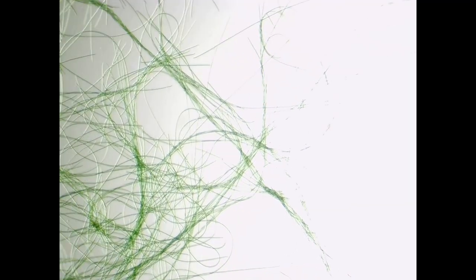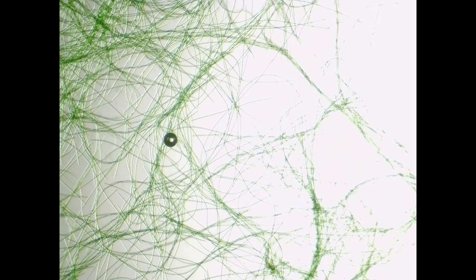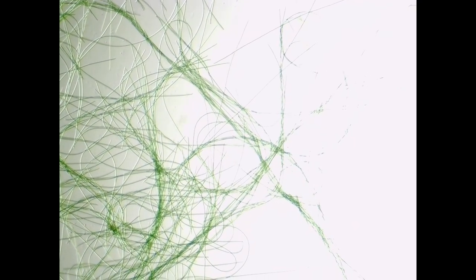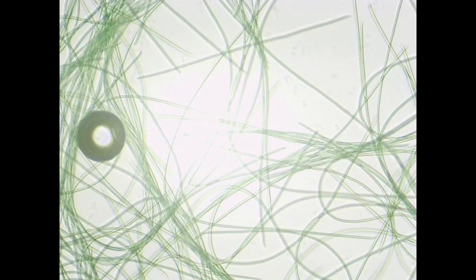It is a type of filamentous cyanobacteria known for its distinctive oscillatory movement, which is where its name comes from. Oscillatoria contain chlorophyll and phycobiliproteins, convert sunlight energy, and produce oxygen.